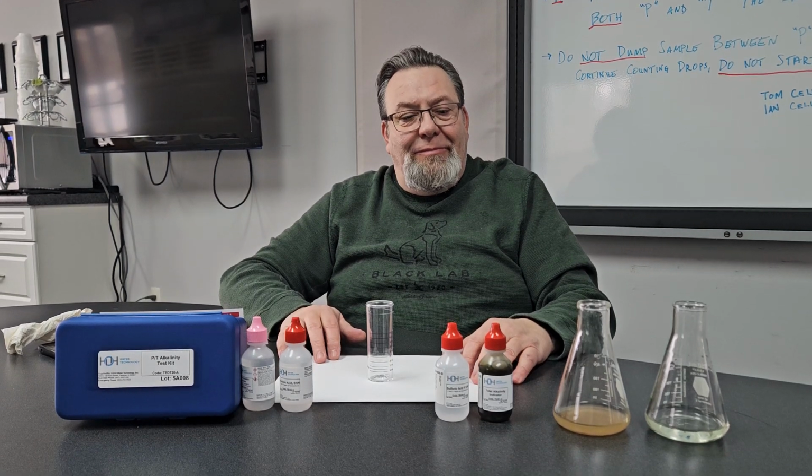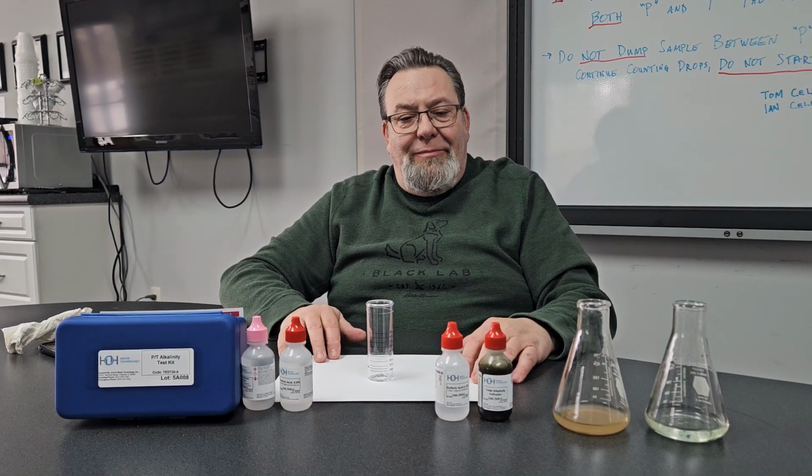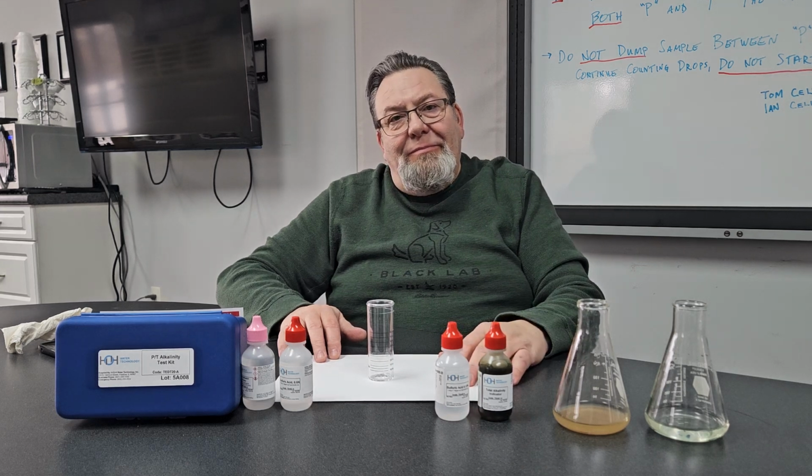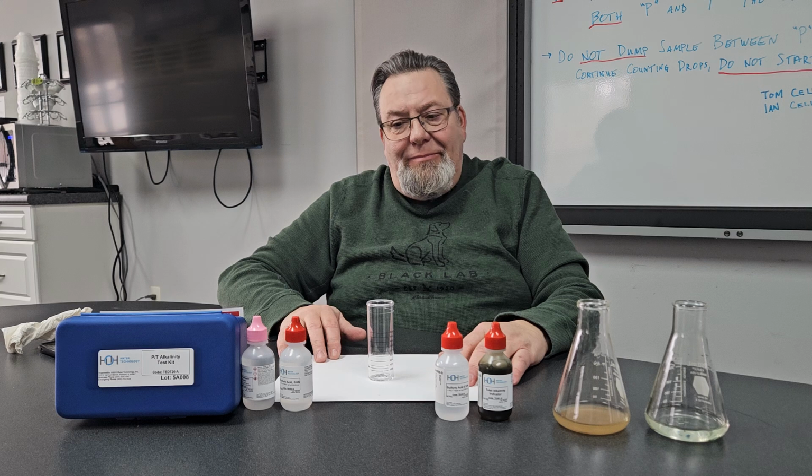Good afternoon, it's Tom and Ian from DNL Water, and we're here to show you how to do the P and T Alkalinity Test Kit. I'm Tom, I'm your narrator, and Ian will be doing the demonstration.